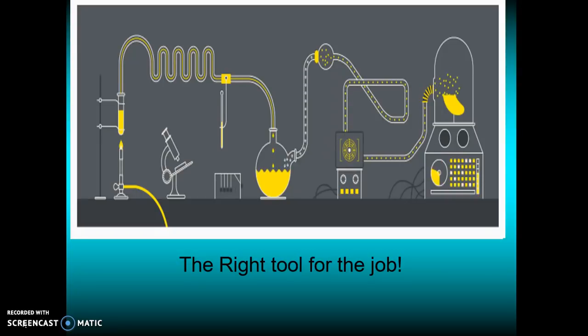Today we are going to take a look at some of the lab equipment so that when you do your first lab, you will understand what the equipment is called and how it is used. Mostly in the lab, you're going to use glassware. Some of the glassware is really confusing at first until you get used to the terminology. Basically, in the lab you're going to use three glasswares, and those are beakers, flasks, and cylinders.